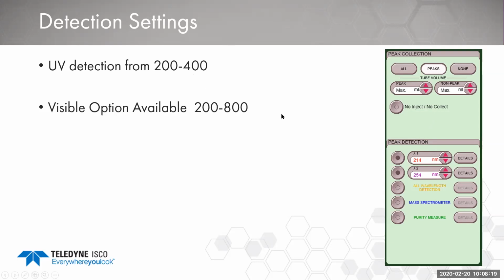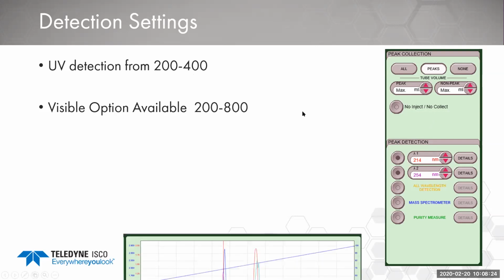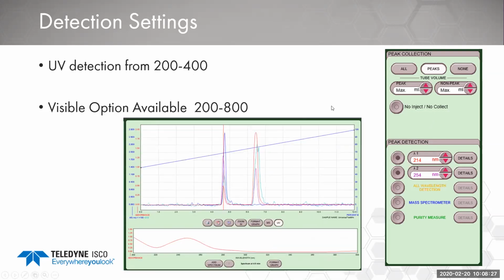I have recently had a lot of customers starting to ask me more about maybe a third wavelength. We can possibly do that. So if you bring up a chromatogram, as you can see down here, a lot of our customers are not aware that we can actually do this. As you'll see, there's two buttons on your data processing where you can see the UV or MS. These are also available during your live running of your samples. So if you bring these up and you select on a peak or a particular retention time of interest, we can actually get a full UV spectrum of that.